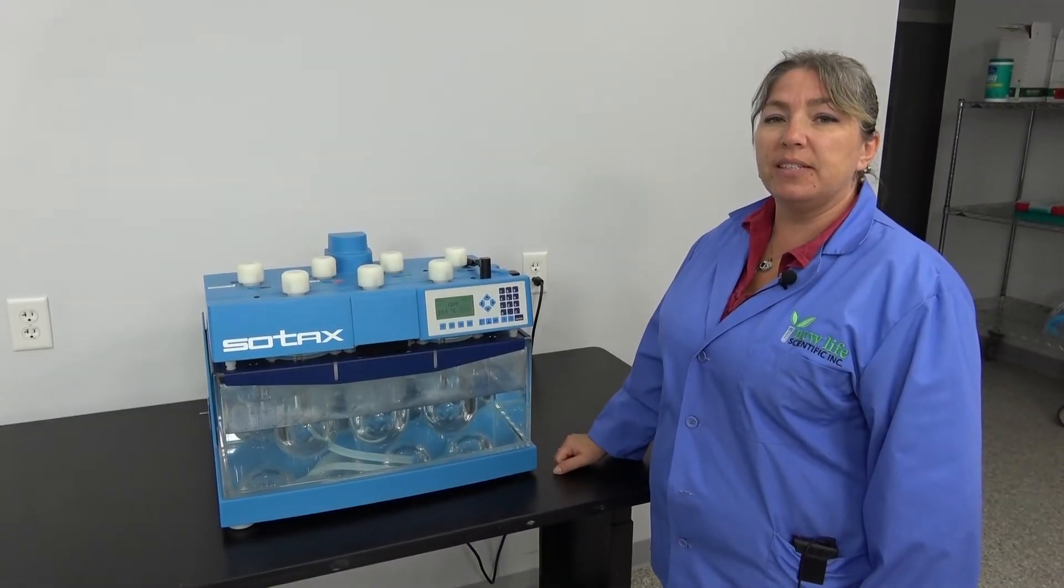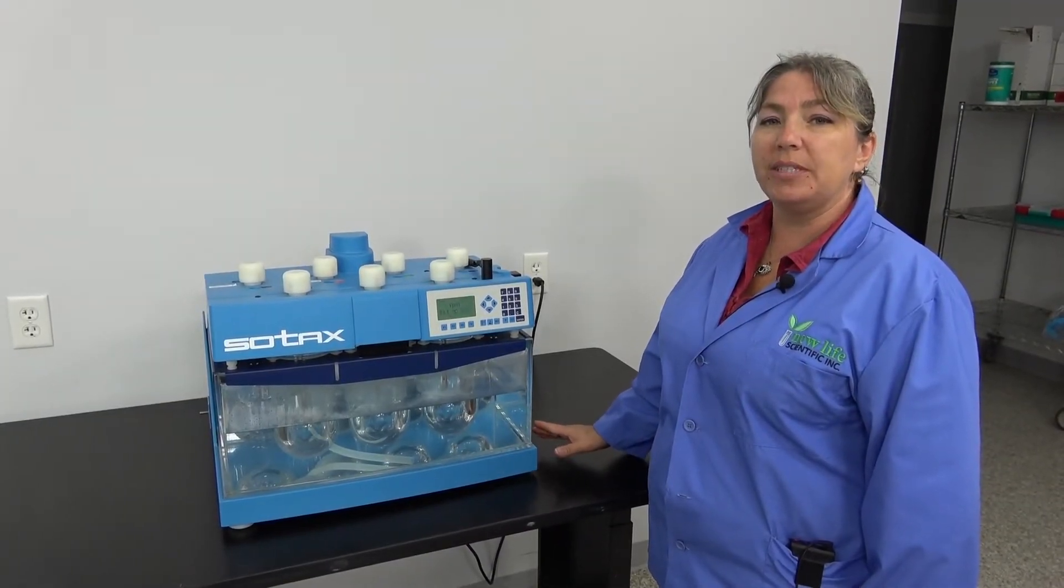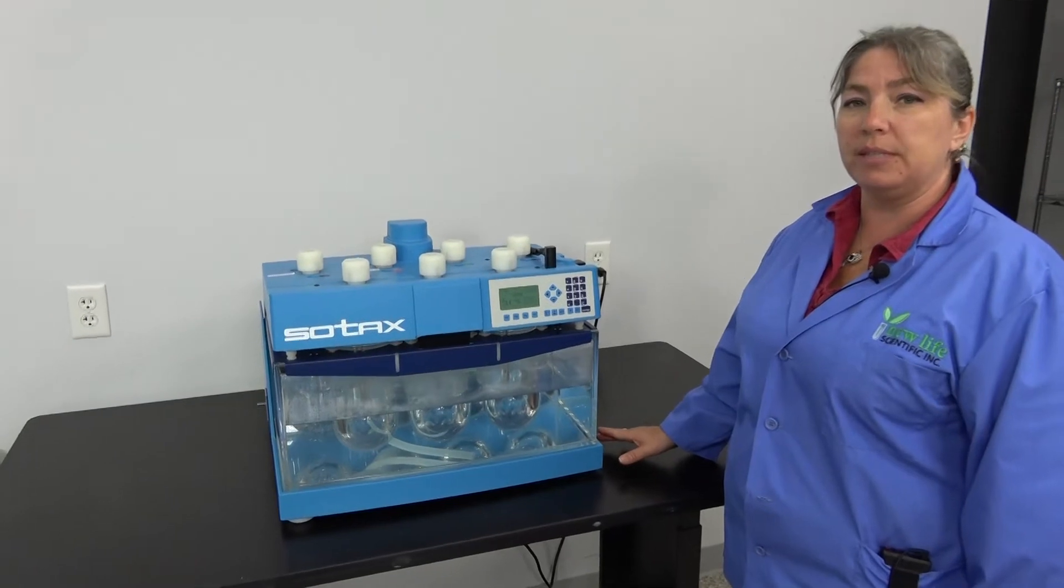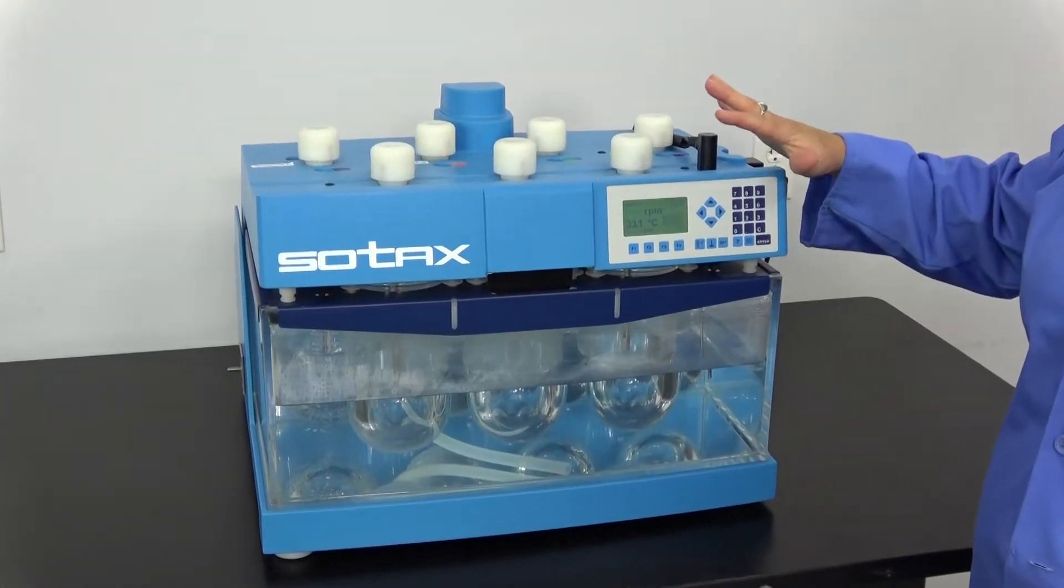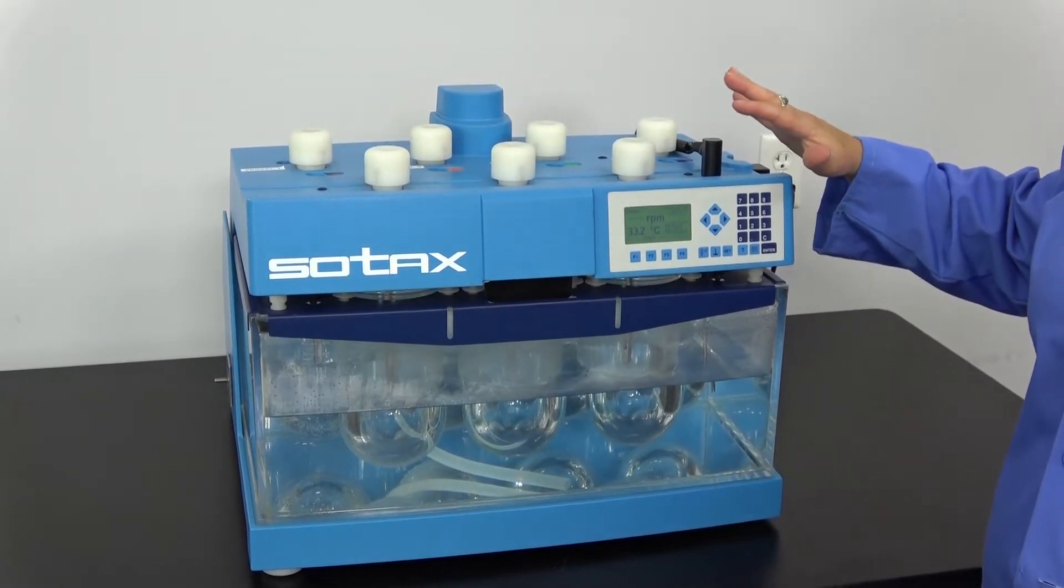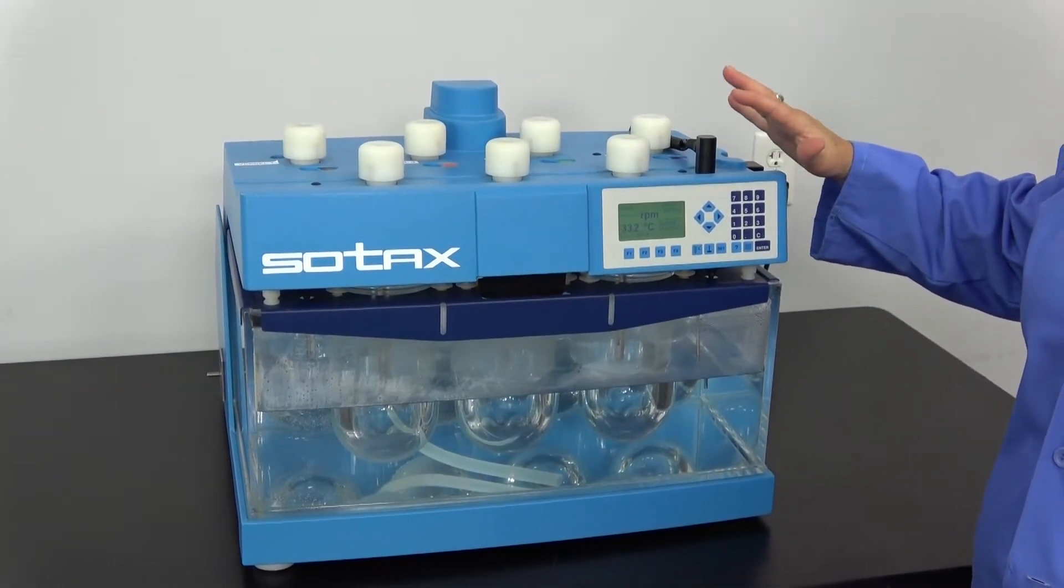Hi, I'm Lori and today at New Life Scientific we're taking a look at the Sotax AT dissolution system. This system can be used as a standalone unit or in conjunction with the Sotax AT7 smart dissolution system.